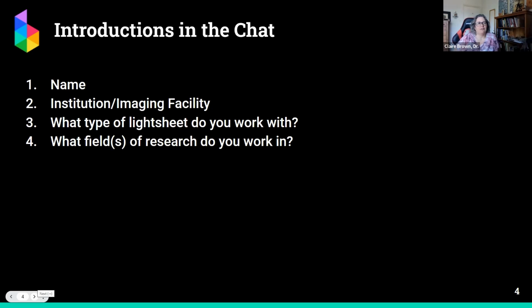And it turned out that there was a problem with the laser attenuation, and it was about 40 times brighter than we thought. And so we actually had to have the laser replaced. So we're just testing it out again this week. Hopefully everything is good now. I was a little worried that we weren't going to be able to do live imaging because there was too much power, but it was actually an issue with the attenuation. So should be good to go now.